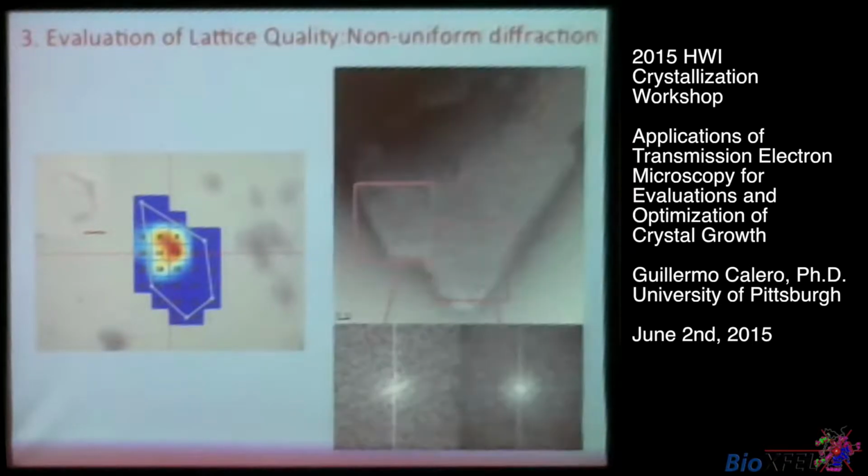Hillary spent quite a bit of time trying to find this, and he was lucky to see, for example, that in this area of the crystal the lattice was quite well ordered, and you had a good black spot. But in other areas, like this one right next to it, it was not ordered. You can see the particles are not really well aligned in this case.